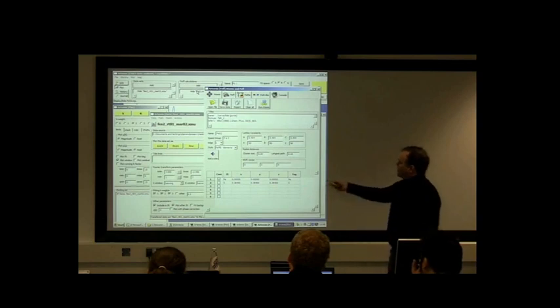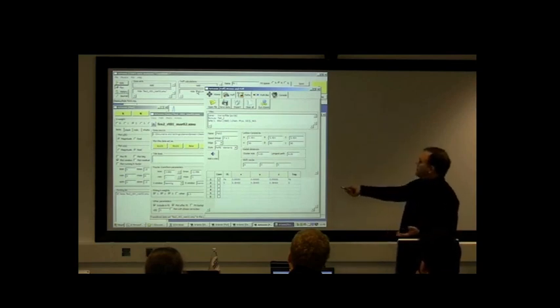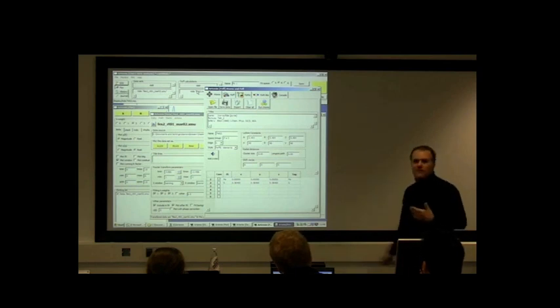There's these weird symbols that describe the internal symmetries of a crystal. The other information that you need are the lattice parameters. So this is a cubic space group, and the unit cell of this cubic space group has all its lattice, well, it's cubic, so all of its lattice constants are the same, and they're all 5.4 angstroms.